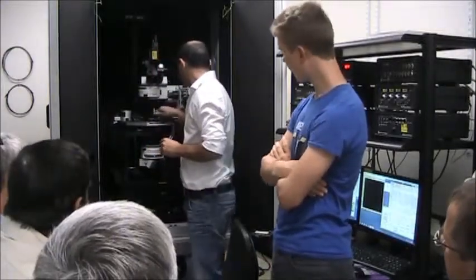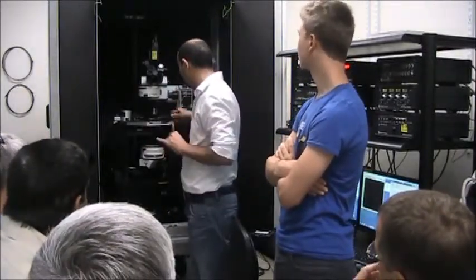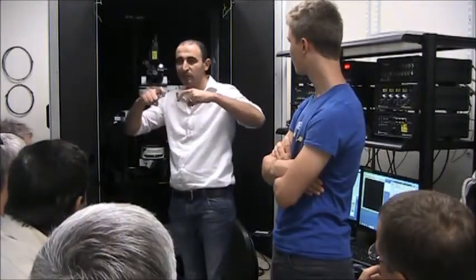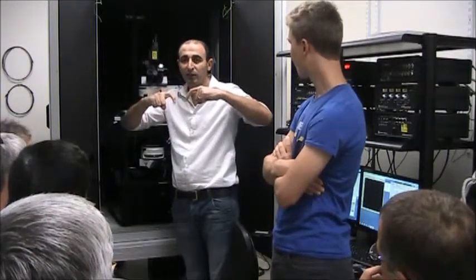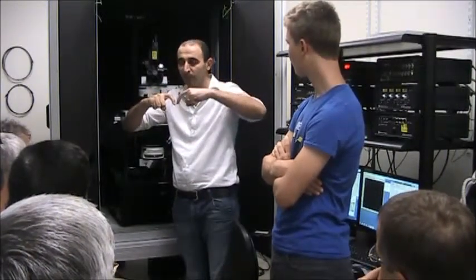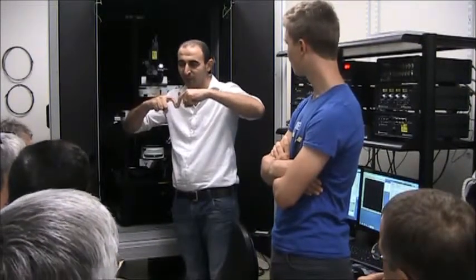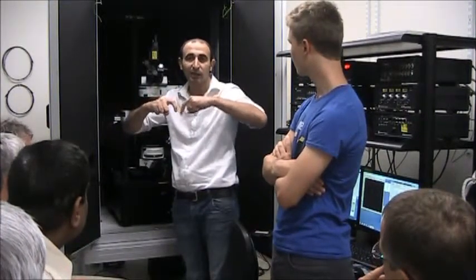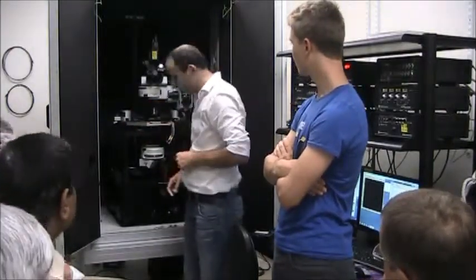So we're going to do a basic AFM operation, just to see the standard operation of the system. But this system, in fact, is capable of multiprobe operation. The previous experiment which we were doing is bringing one probe to feedback, delivering the line into the surface, and then bringing the second probe in close proximity to that, and scanning, starting from the first probe point, collecting the topography and collecting the near field optical signal. Now the signal, one fiber probe.